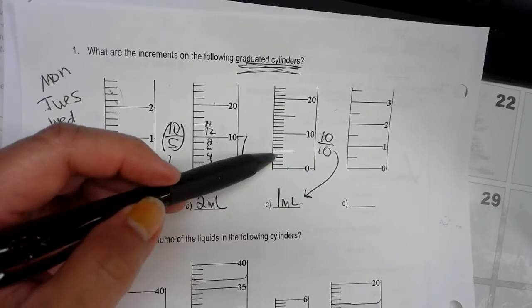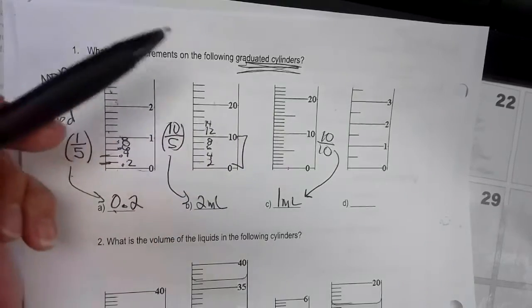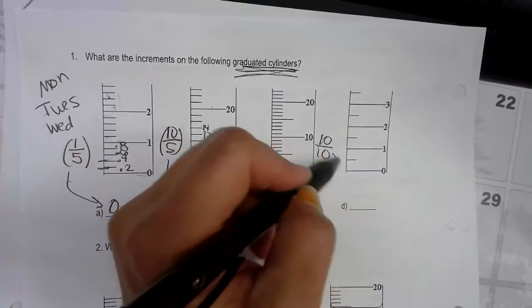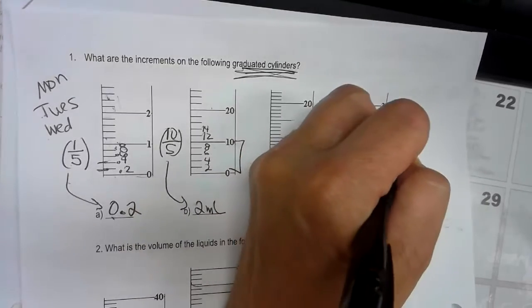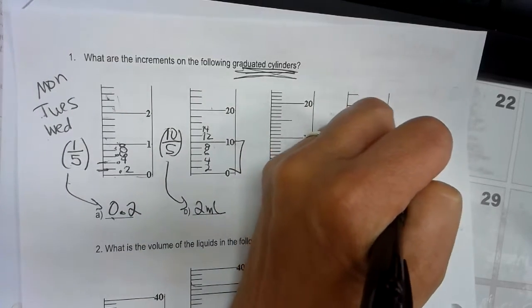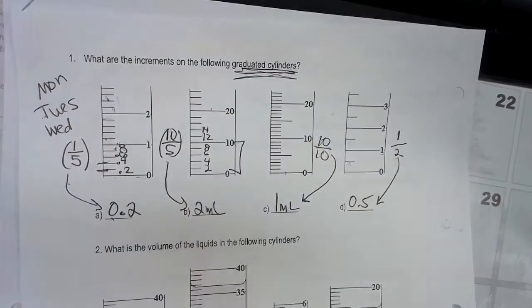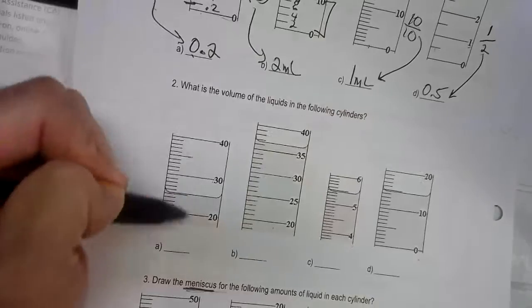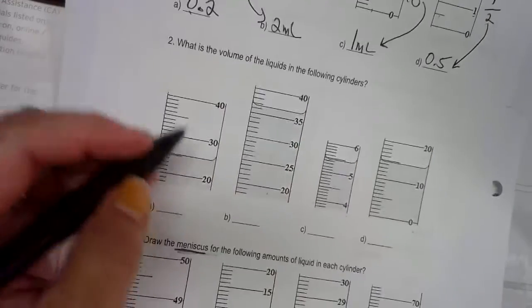So this is like 1, 2, 3, 4, 5, 6, 7, 8, 9, 10, and 11, 12, 13, 14, 15, and so forth. Now what happens when you only have 2 divisions with 1 mil? So it's like saying 1 mil divided by 2 divisions gives you a decimal of 0.5. So these are kind of like decisions you have to make when you read these in order to read them, okay? So let me do 1 or 2 of these here.